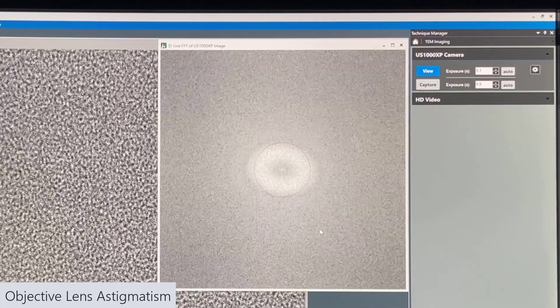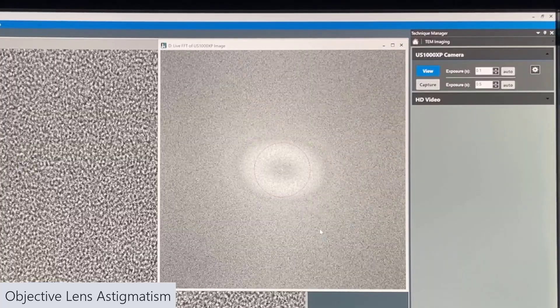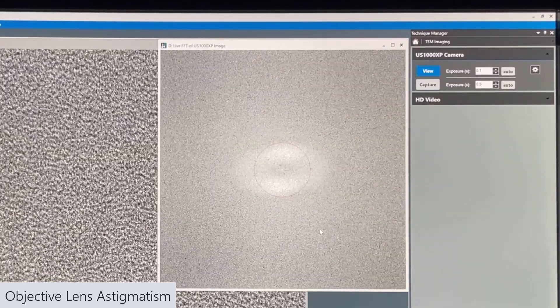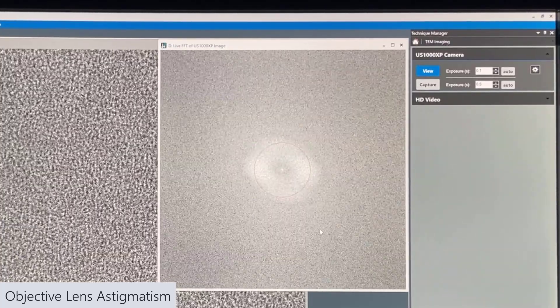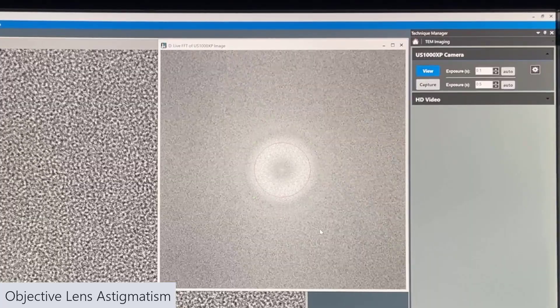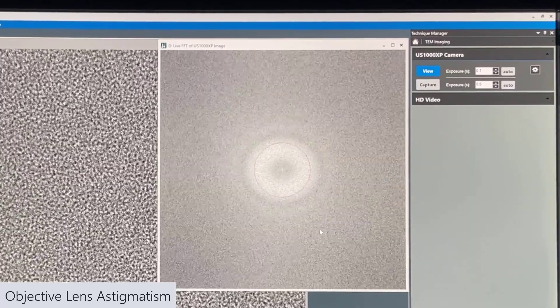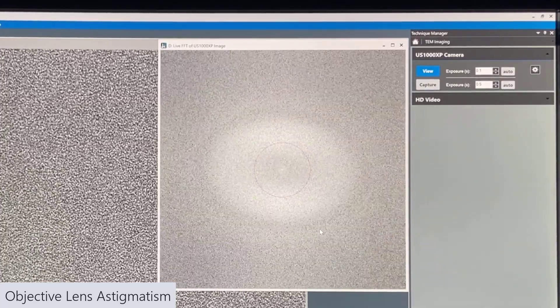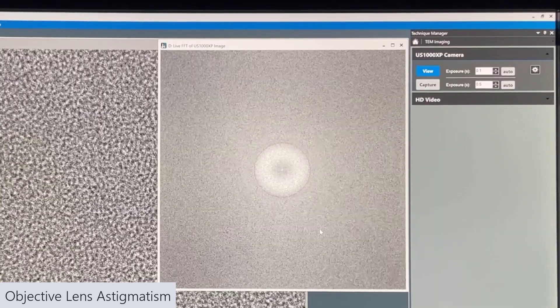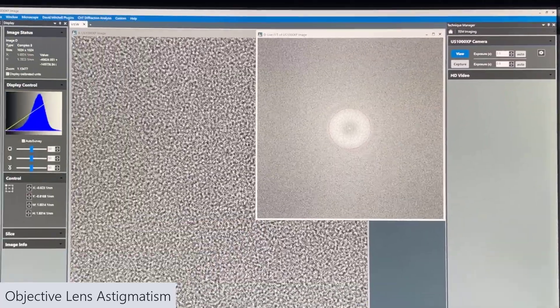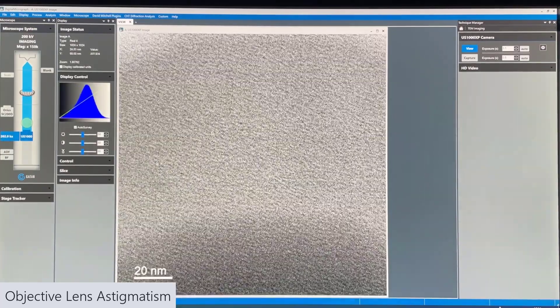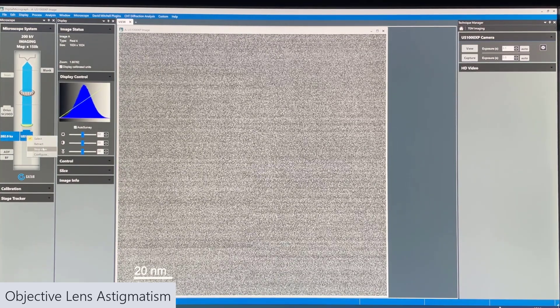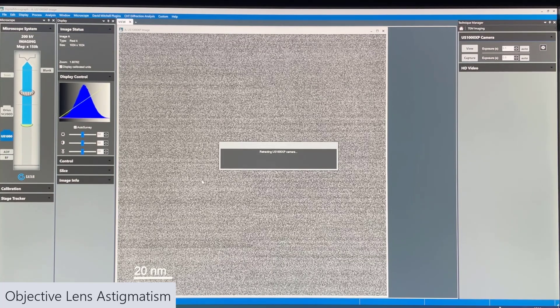Zoom out to see some particles, but for this alignment we want to focus on amorphous material. Zoom in to the carbon film supporting the sample and condense the beam until you start to see those little blobs — that's the amorphous material. Do Process > Live > FFT, or Ctrl+Shift+F, to get an FFT of the field of view. Put down a circle annotation — hold Control and Shift while left-clicking to ensure a perfect circle — as a guide. Then use the objective stick button and deflector stigmator knobs one at a time to make the oval FFT pattern more circular. If the ring is hard to see, adjust the objective focus fine knob. Once the pattern looks good, deselect the objective stick button, close the FFT, put the screen back down, and retract the camera.